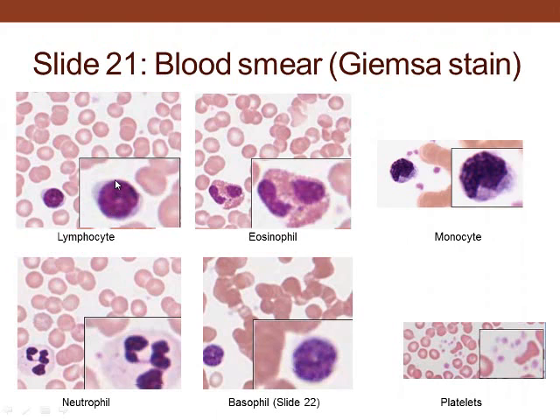This is a nucleus from here to here and a little bit of cytoplasm and a fairly spherical nucleus we see, as opposed to the eosinophil, a lobulated nucleus and big red granules. Here's a monocyte with a kind of horseshoe-shaped nucleus and a lot of cytoplasm, kind of large like the eosinophil. And then the neutrophil, which has granules in there but very small. And then we have the basophil, we have the granules above the nucleus.